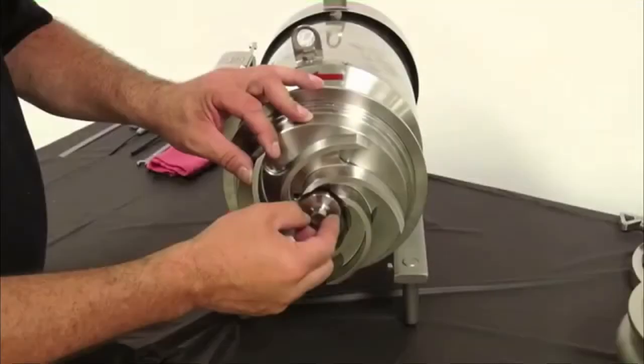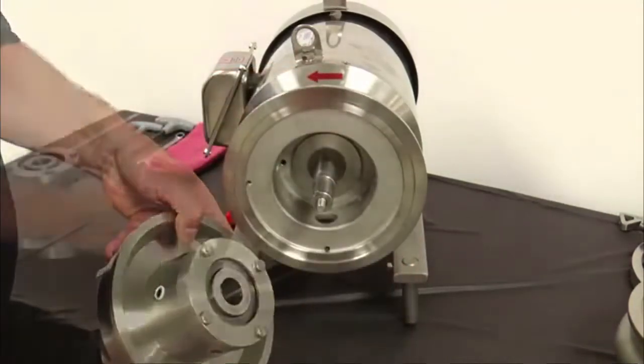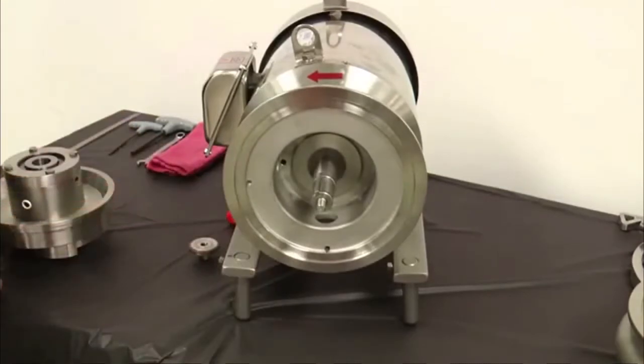The Type 4 seal is essentially two Type 1 seals assembled back to back in a chamber, which bolts to the back plate in place of the stationary seat retainer. Except for the additional components of the chamber and seals, Type 1 and Type 4 components are interchangeable. Once the pump has been relieved of any product pressure and the power has been shut off and locked out and the casing has been removed, remove the retaining bolt and the impeller assembly from the stub shaft and place on a clean flat surface.